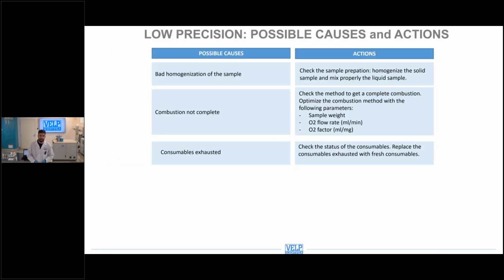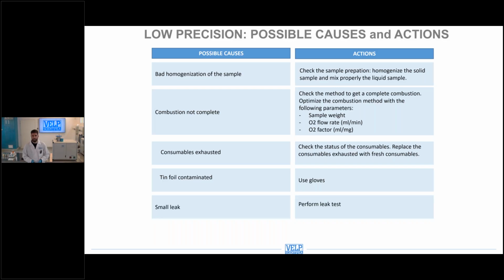Even in this case, we suggest checking the status of the consumables and replacing them with fresh ones if exhausted. Be sure that you use gloves when you handle the tin foil in order to not contaminate it, and perform a leak test.